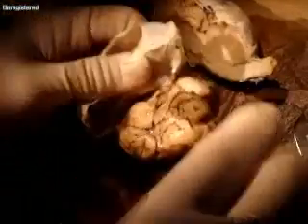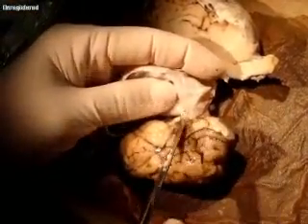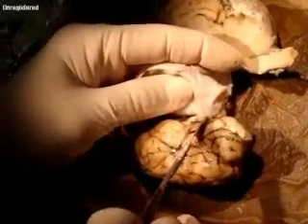Now, when you take these off, there are some cranial nerves that are attached, and it is possible that you might actually detach the cranial nerves, and they might wind up inside the dura. So be really careful. Don't be upset if that happens, because it happens to everybody, probably me too.